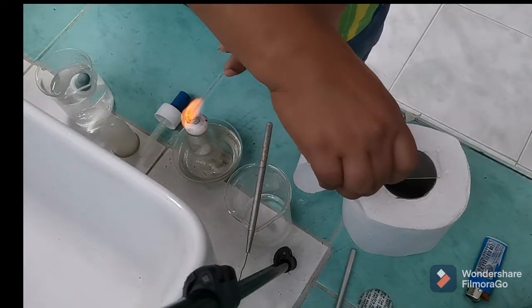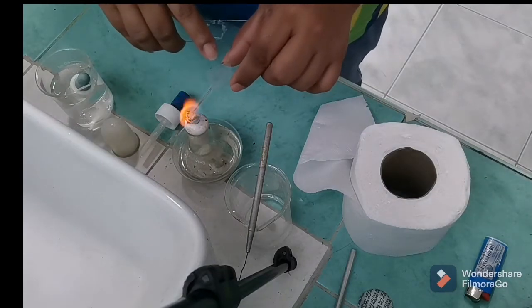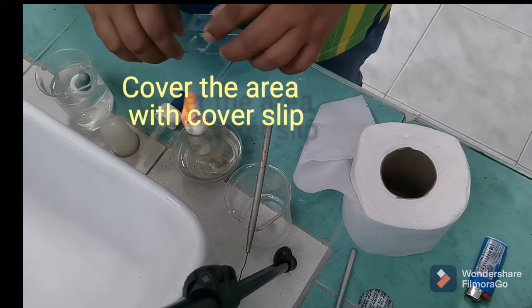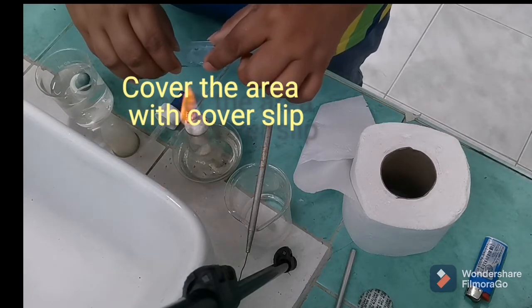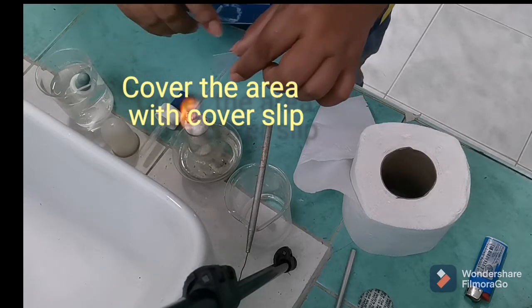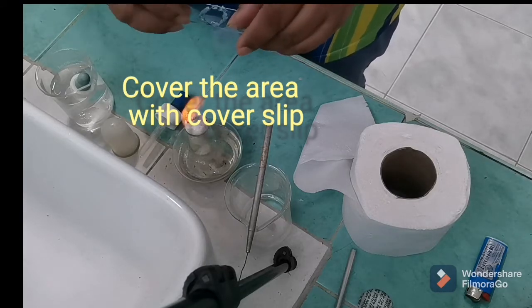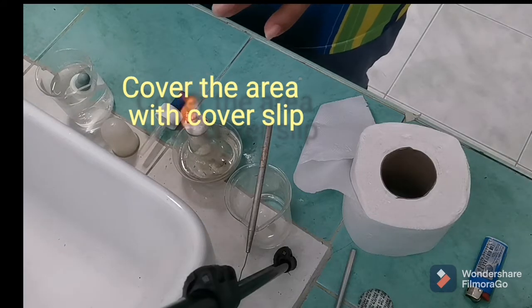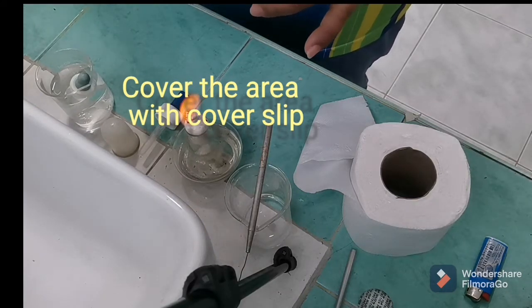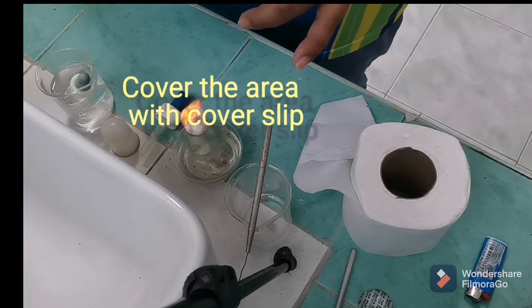So we are just simply going to put this over there. So let us see if the size is just the same. So the target is in that manner. As per procedure, it says that we are going to place it at one side and then flip it to the other side.